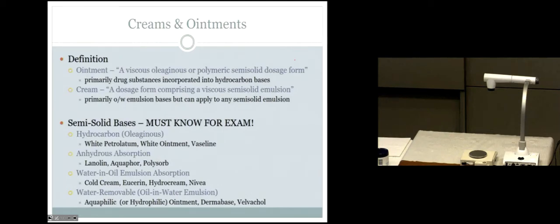So question to you to start off with is the difference between a cream and an ointment. And this is somewhat important for you because you're going to have to type a label, right? You're going to have to type on the exam drug name, strength, and dosage form. And whatever you make, I'm going to hold you to correctly calling it either a cream or an ointment based off of the modern definitions for that.